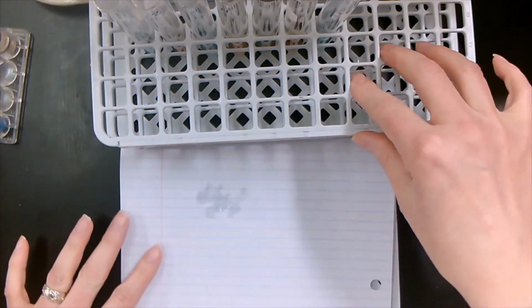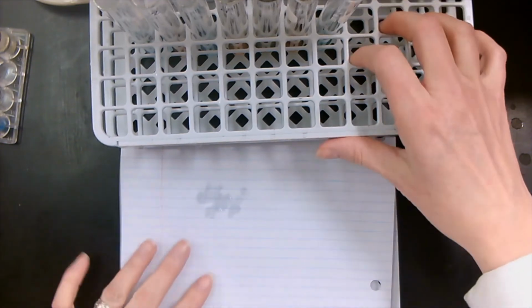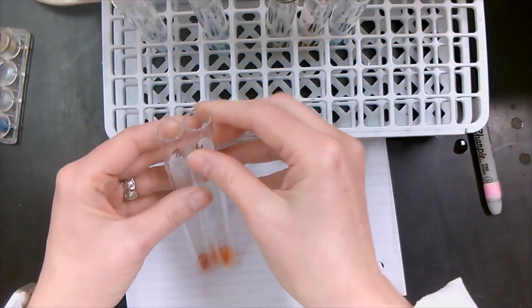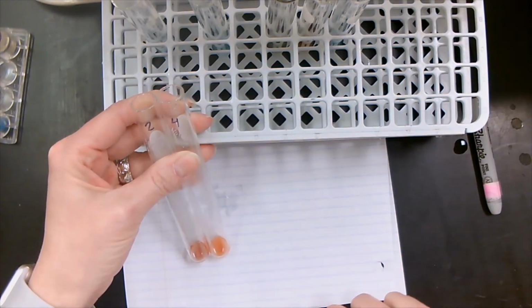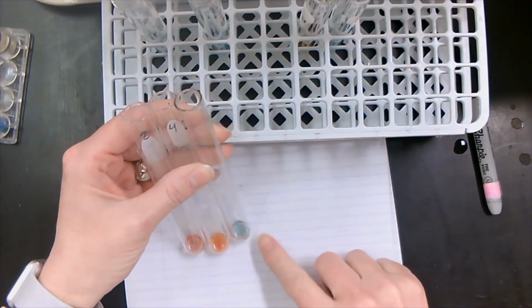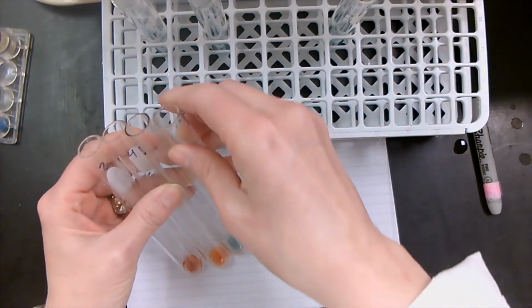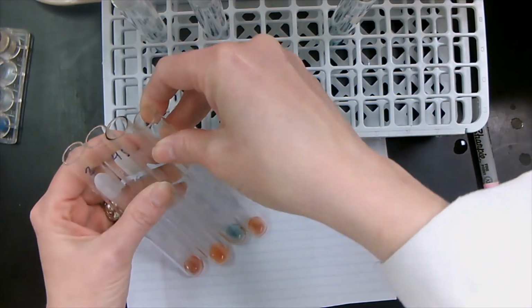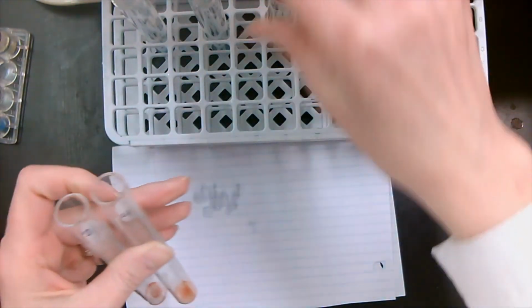So these are all our results. Therefore, we can actually see which ones of these have glucose and which ones don't. So we can see that our glucose has glucose, and that our starch with hydrochloric acid, we were able to obtain some glucose in there too. The brown sugar, just a little bit, so it has some glucose in it. And finally, our corn syrup. This one has glucose as well. Okay, perfect. So those were our results. Thank you very much.